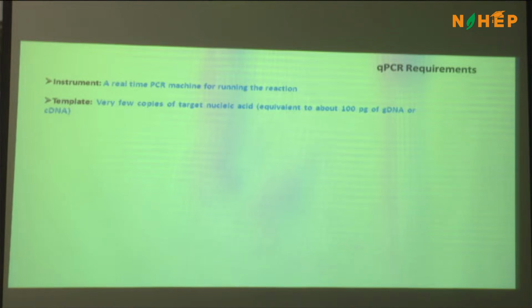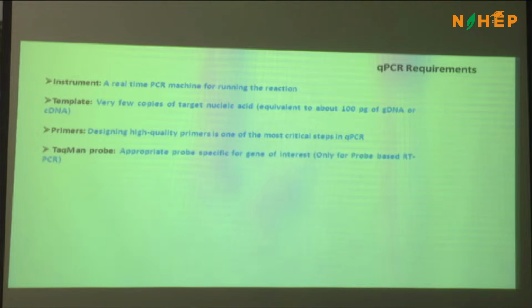The follow-up lecture is about that only, the biological sample preparation. Primers, of course, very, very important. So we have a primer designing class also this afternoon lined up. We will teach you how to design a primer for PCR as well as qPCR. Okay. And you have a probe. If it is a TaqMan or probe-based, you have to design one.